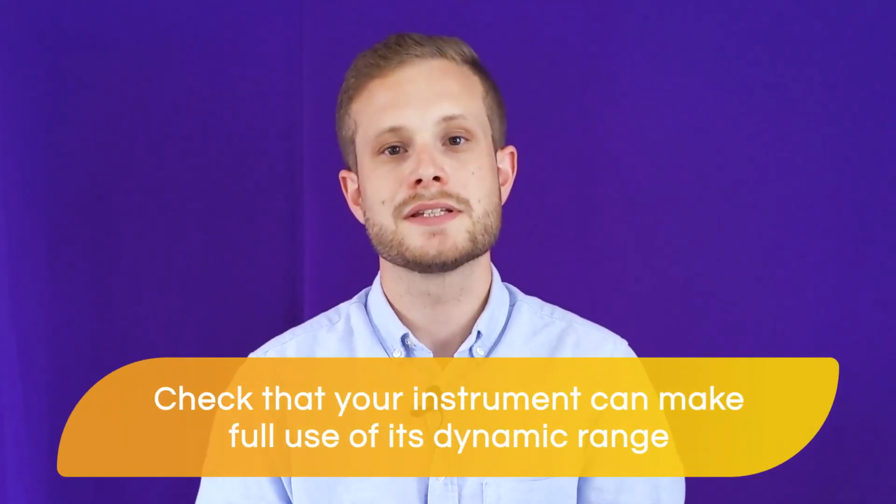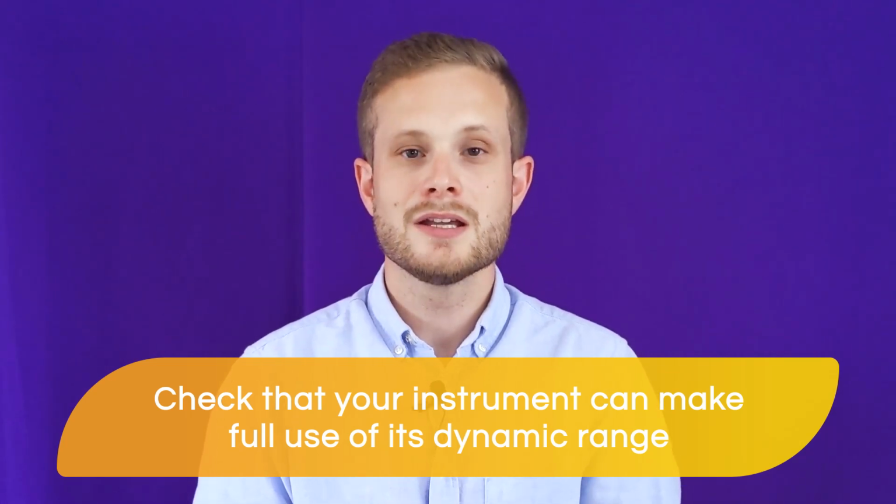The higher the dynamic range of the detection hardware, the less likely you are to experience signal saturation. So you should choose the imager with the widest dynamic range possible to avoid signal saturation altogether and obtain the highest quality data. You should also check that your imager can make full use of its dynamic range when it saves images. Without getting too technical, most imagers store images as 16-bit TIFF files, which can only store data in a 4-log range. Empiria Studio software from LI-COR stores images in the equivalent of a 22-bit format, which allows data in a 6-log range to be maintained in full.